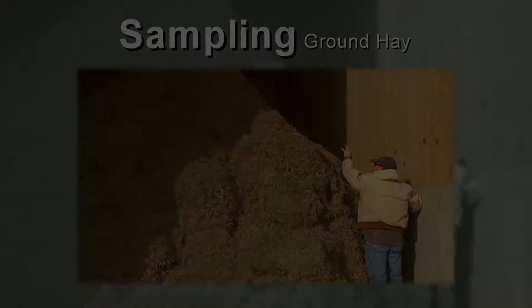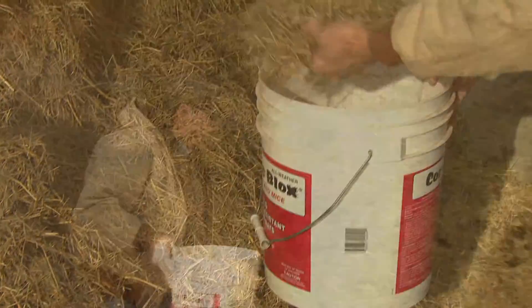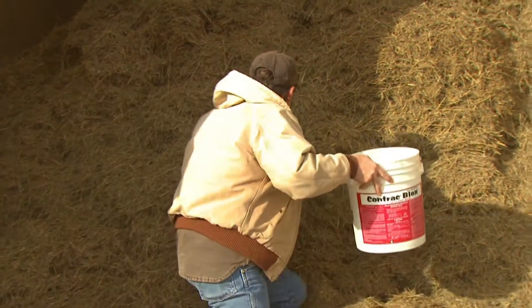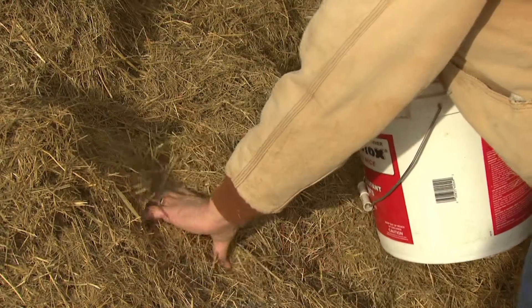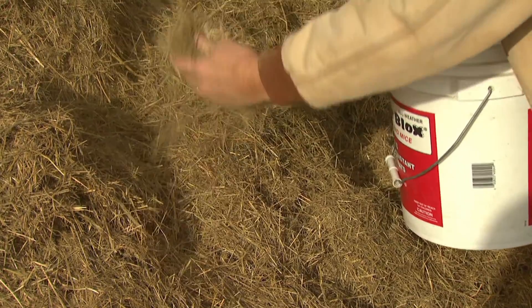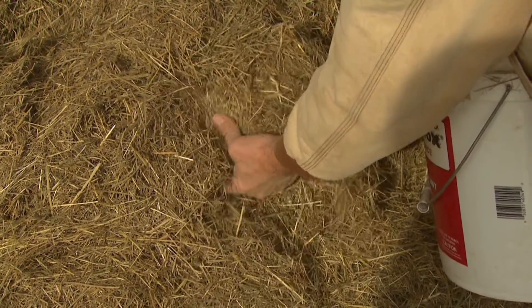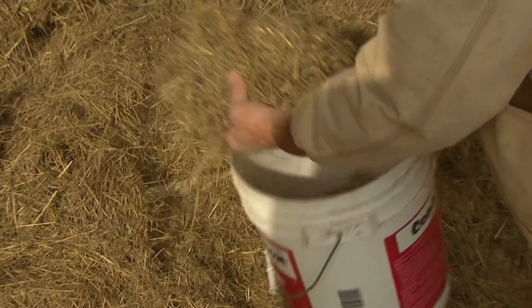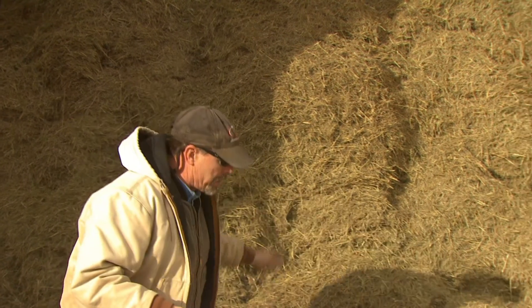To sample ground forages, you will need a five-gallon bucket. One-fourth of the sample should be taken from the top half of the pile and the rest from the middle half. Take hand samples, avoiding allowing fines to sift through the fingers. The palms should be facing up, knuckles facing down, and fingers together — not spread apart.